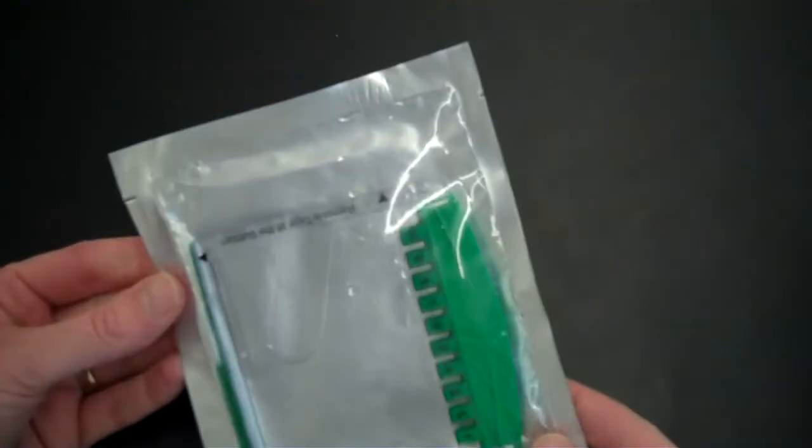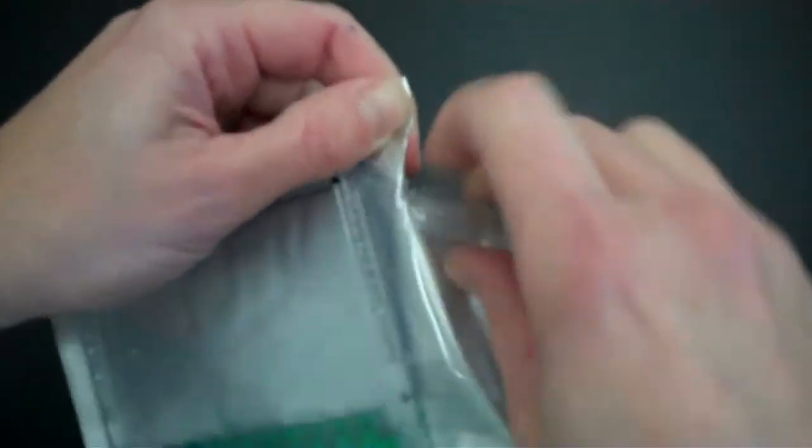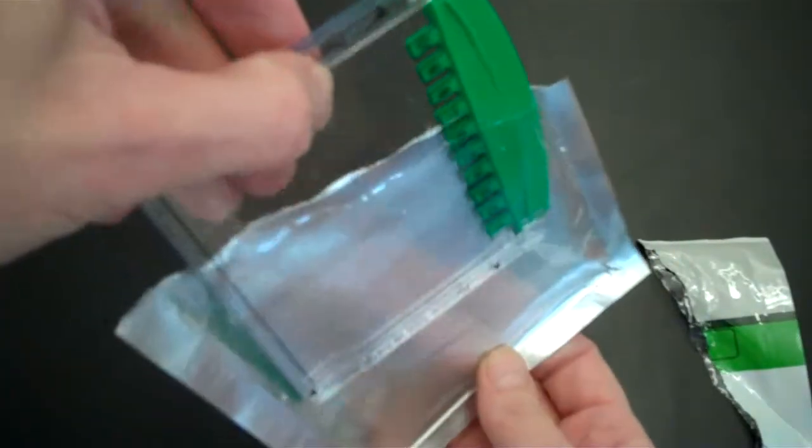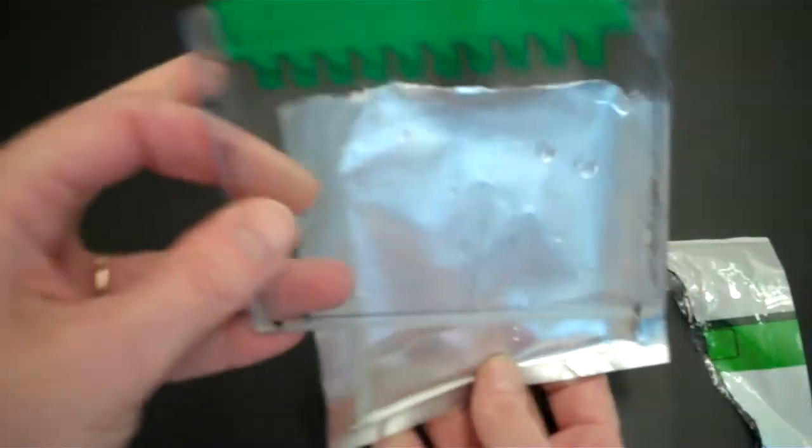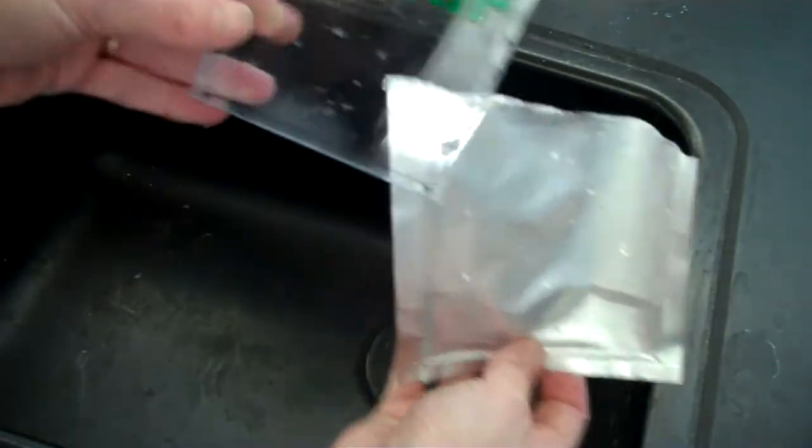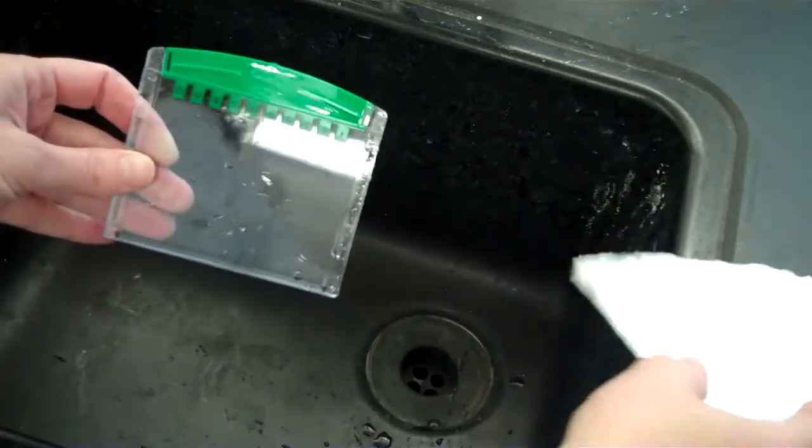The first thing that you're going to want to do is to open the package. There'll be a tab up here. You open up the package and you remove the gel. I recommend doing this over the sink. So it's in buffer, I'm just going to dump the buffer into the sink and set the package aside.